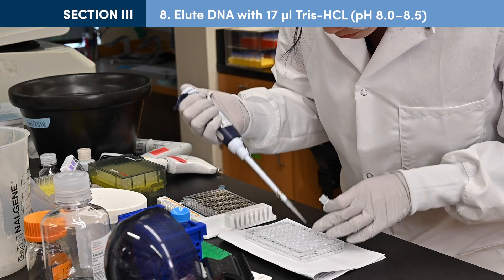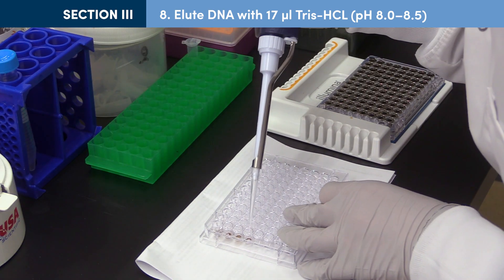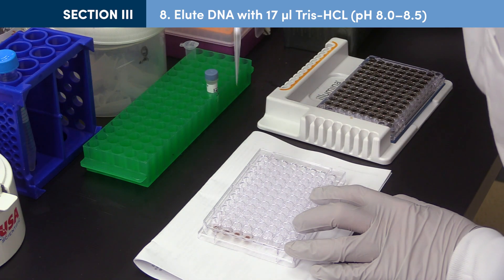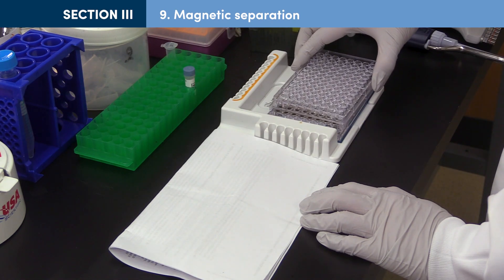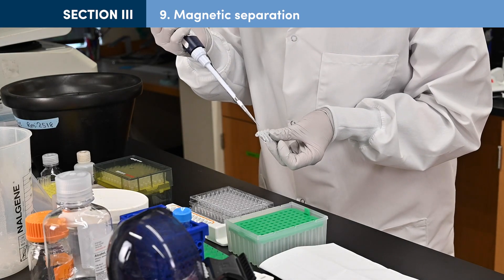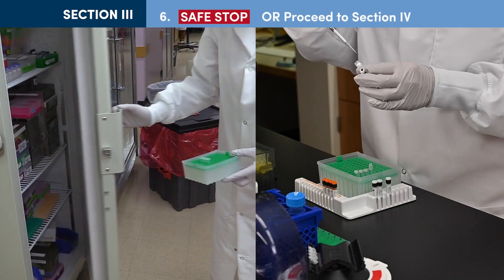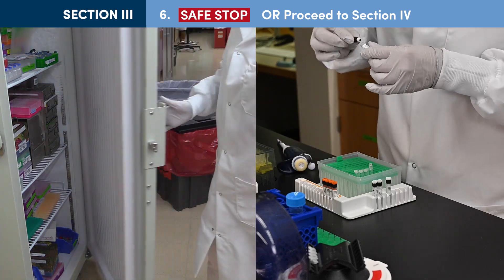To elute the DNA, remove samples from the magnetic stand and add 17 µL of tris chloride. Re-suspend the beads by pipetting up and down 10 times. Incubate at least 2 minutes at room temperature, then place the tube on the magnetic stand for 5 minutes. After the solution is clear, carefully transfer 15 µL of supernatant containing the DNA targets to a new PCR tube. Samples may be stored at minus 20°C or you may proceed directly to PCR enrichment.